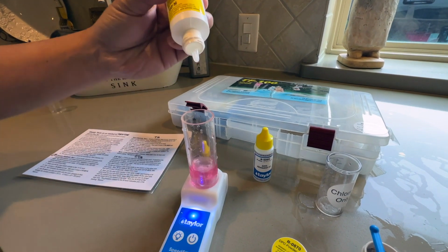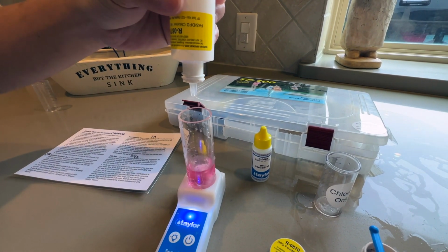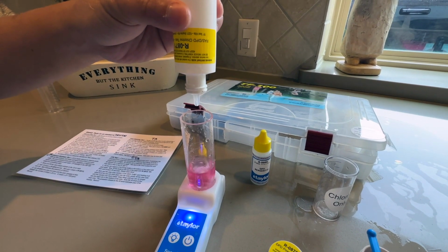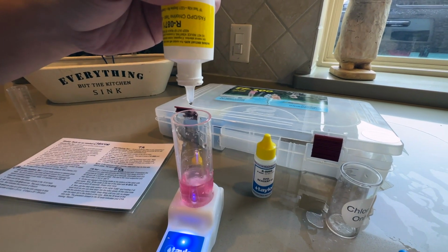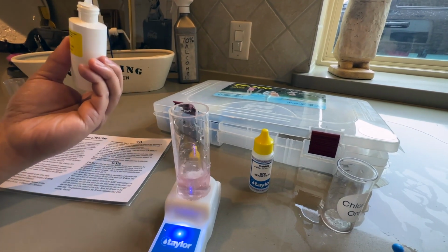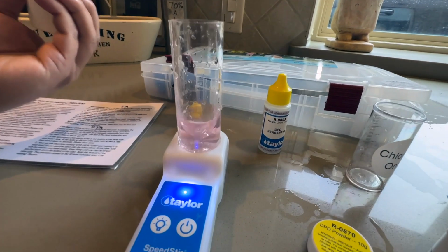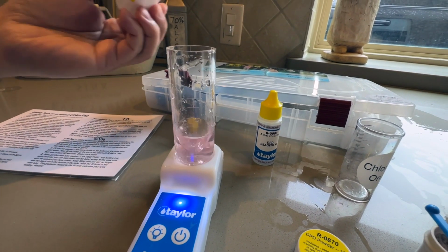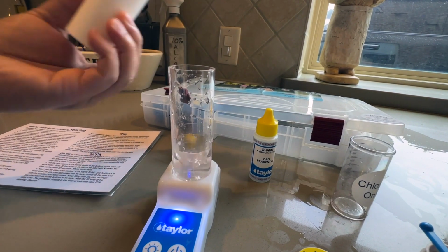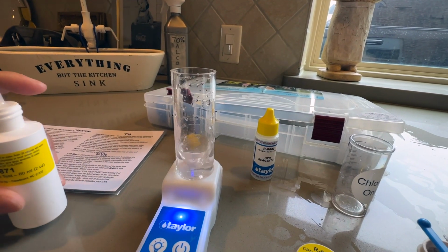So when dropping, you've got to make sure that your container is completely straight so that you can clearly see the drop. So we're going to count 1, 2, and we're going to pause and see. It's still a little bit pink. It's not 100% clear. So I'm going to add the 3rd drop. There you go. And now it's completely clear.